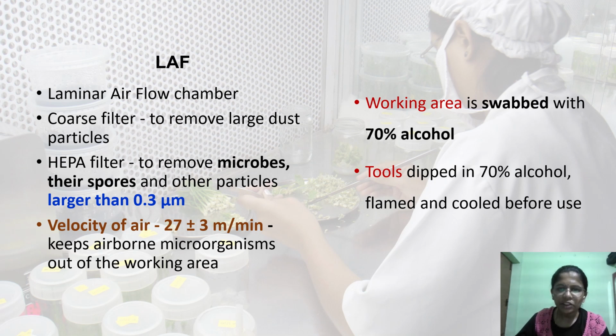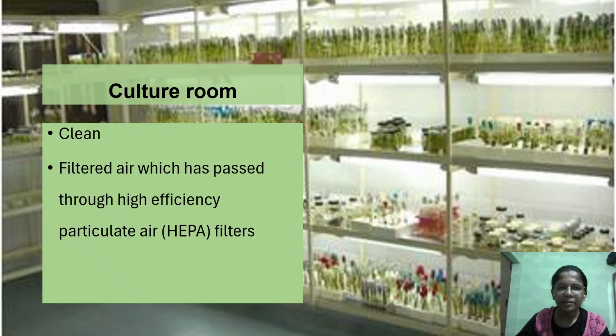This contamination may occur mainly whenever we are transferring the tissue culture plant, like the explant, into the media. During that time we can expect this problem. Normally for this, even before entering the laminar airflow or carrying out any work under laminar airflow, we always recommend disinfecting even our hands and also the surface area.